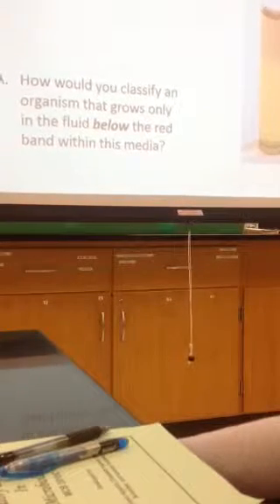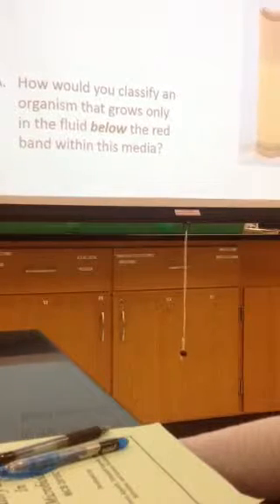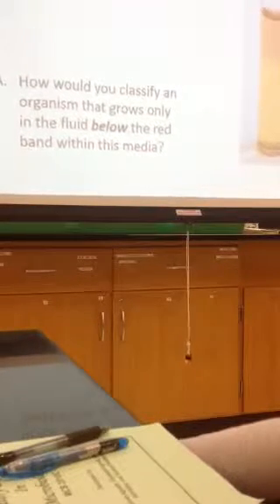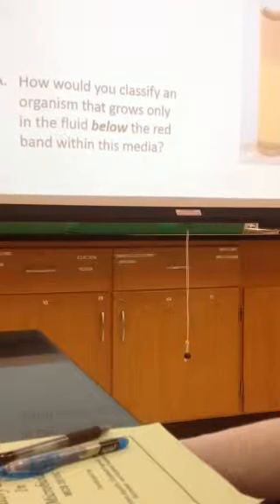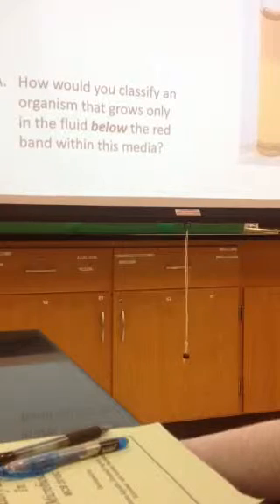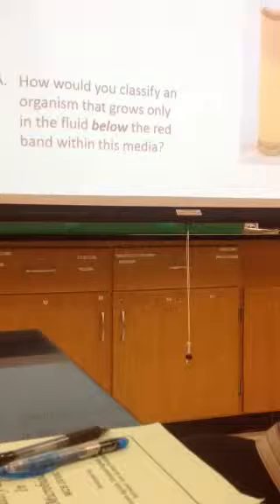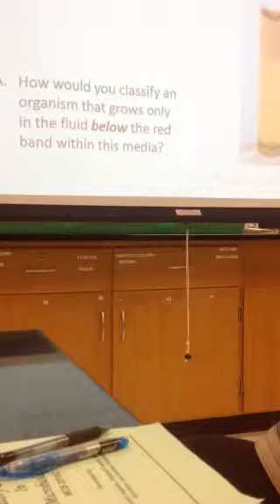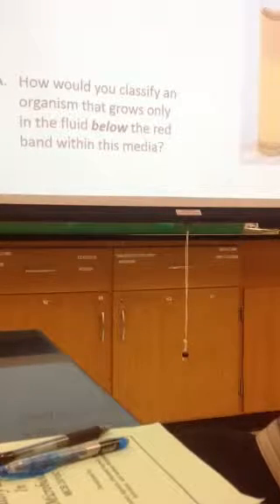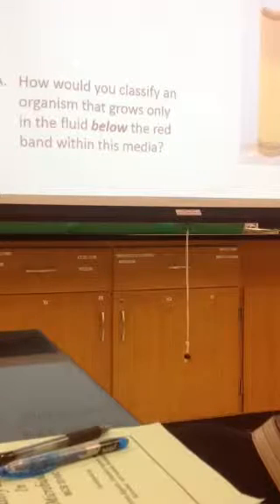So second question on this. How would you classify an organism if it only grows in the fluid below the red band on this one? Anaerobic. If it grows away from oxygen, it's anaerobic. What if it grows just in the red area? It's aerobic. Okay? Are these questions fair? Yes.